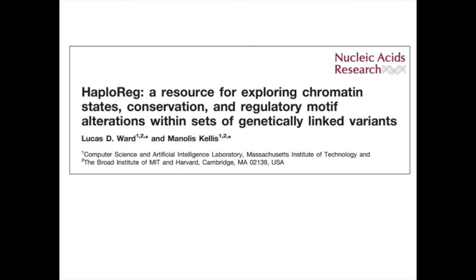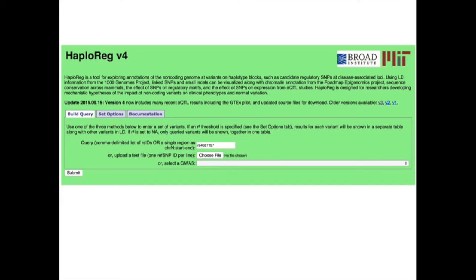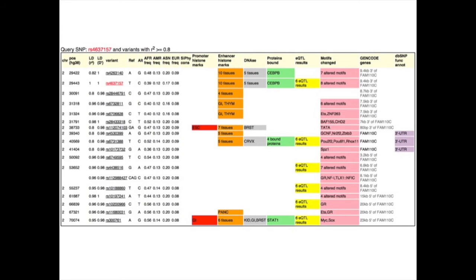Now talking about HaploReg, a tool from Manolis Kellis' lab currently on version 4. It works essentially the same way at the beginning — if you want to investigate a certain SNP or region, you query that in the box. However, when you hit submit, you'll notice there's actually a list of SNPs rather than just the one you queried, because HaploReg lists all other variants that are in LD with the variant you queried. By default, it uses a European LD structure and reports all variants with an R-squared of over 0.8, so you can investigate not only the SNP you're interested in but also possible SNPs in LD that may be driving the association.